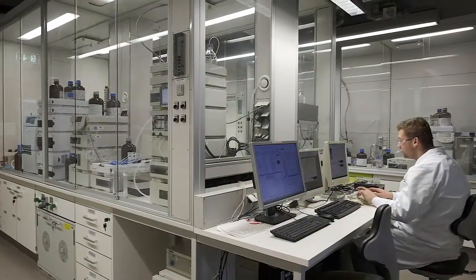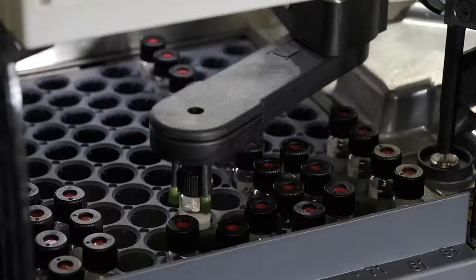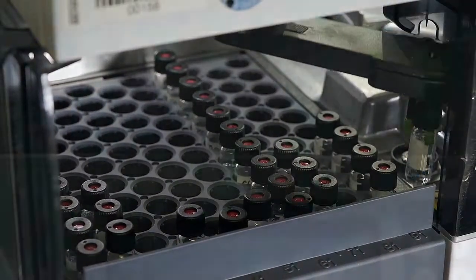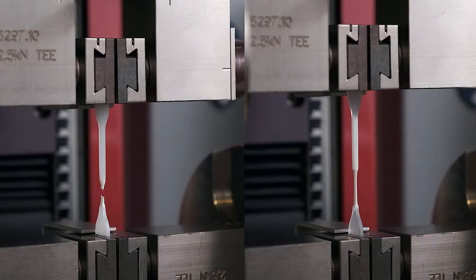We identify the individual potential for quality improvement by extensive analytical characterization. Hence, the specimens are inspected by fire and tensile tests.